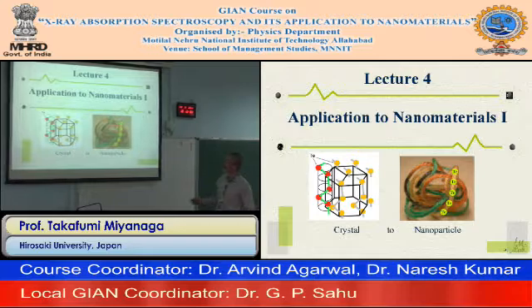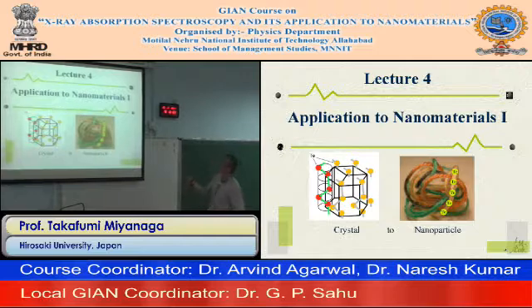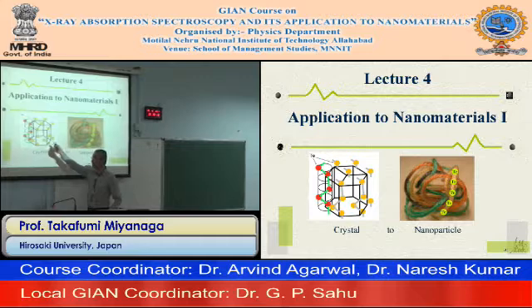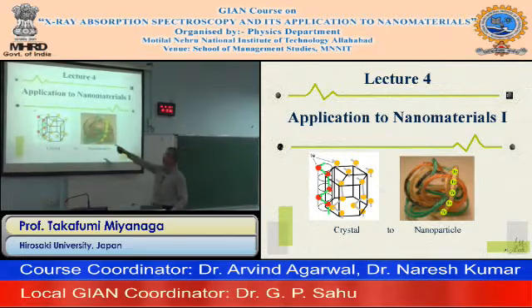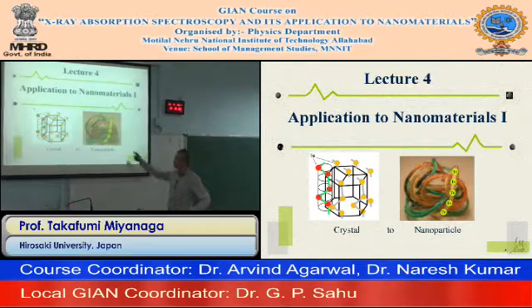This is the cover story for nano tellurium. Tellurium structures: the trigonal structure has strong chains. So the thermal property of the tellurium crystal has one-dimensional properties. And what is the problem? What is the structure in the nanoparticles? That is our first subject of studying the EXAFS.